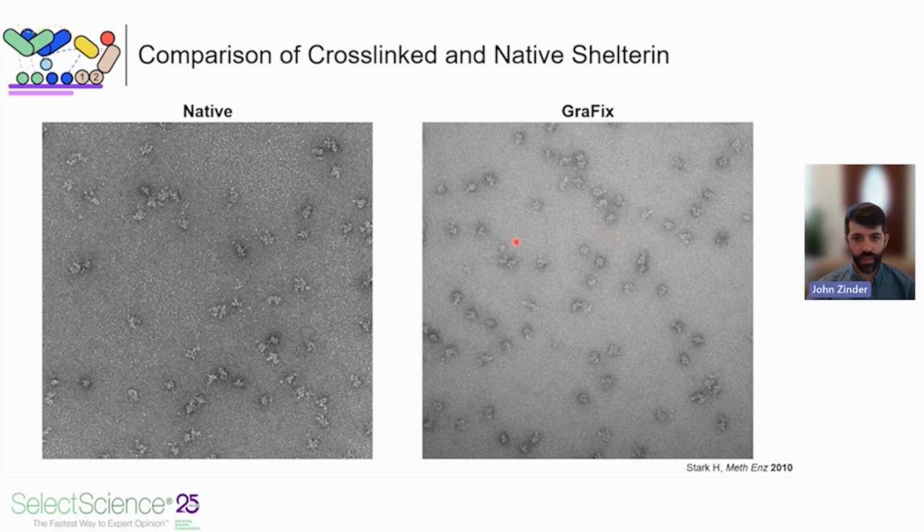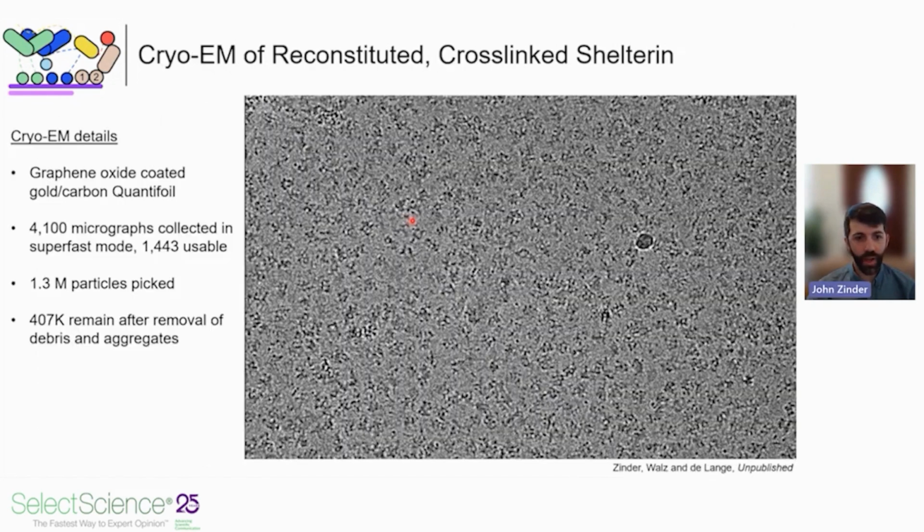Through this protocol, we got these really nice complexes, at least similar in shape at low resolution, from the same preparation. And we decided to go forward with this for Cryo-EM because we were noticing a bunch of denaturation during vitrification. And I'm cutting a very long story short. This was not the only thing that we tried. We tried a number of different complexes, subcomplexes, DNA substrates, etc.